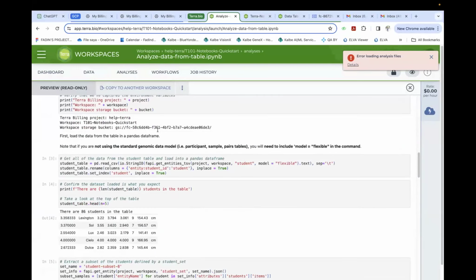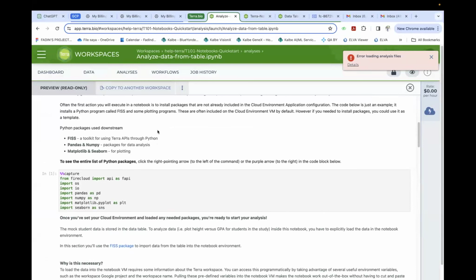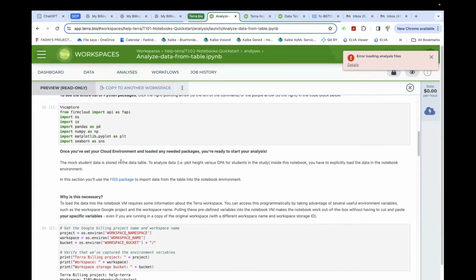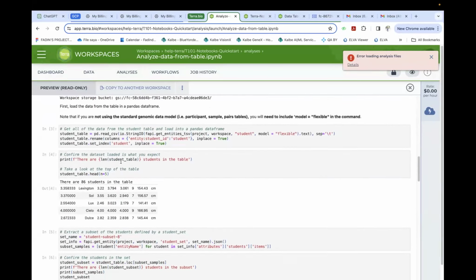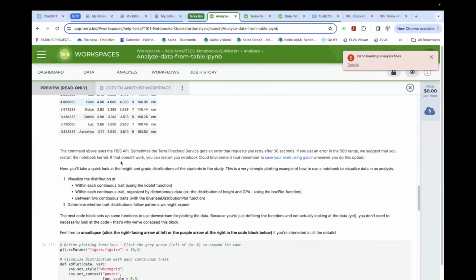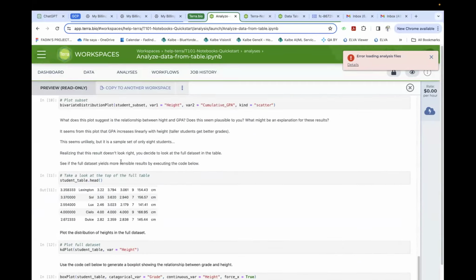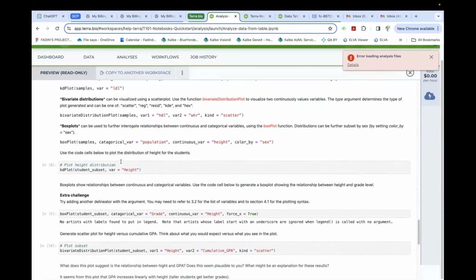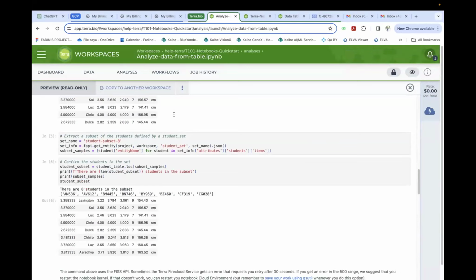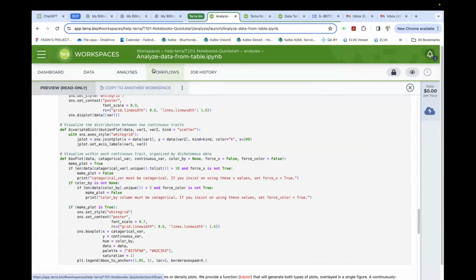Okay. So you can code your Python code in this workflow section analysis menu in the Terra Bio workspaces. You can pretty much type in your Python code using data in the Terra Bio workspaces. Unfortunately, I am having a problem to clone it, so maybe I cannot show you guys how to run it, but I will take a look at what is going on in the analysis.